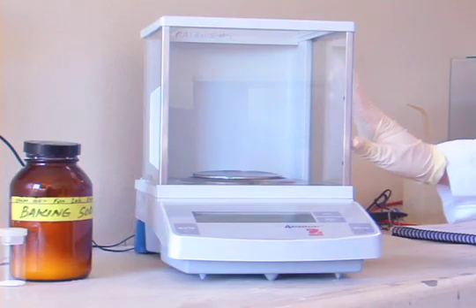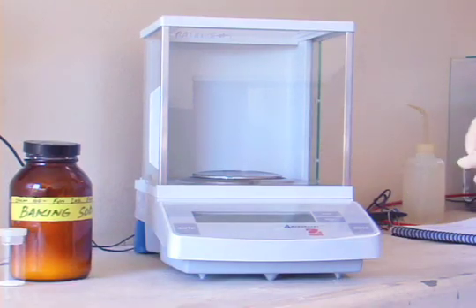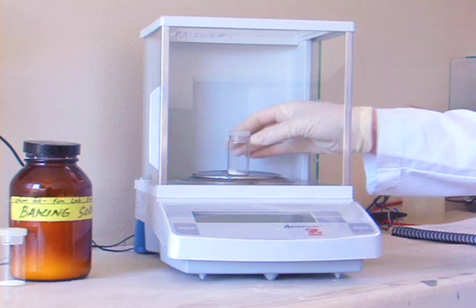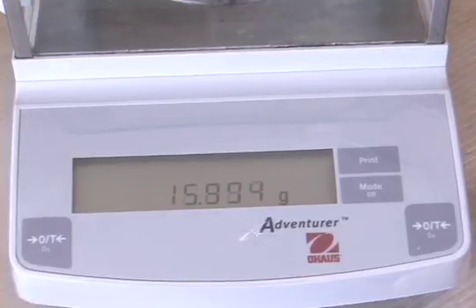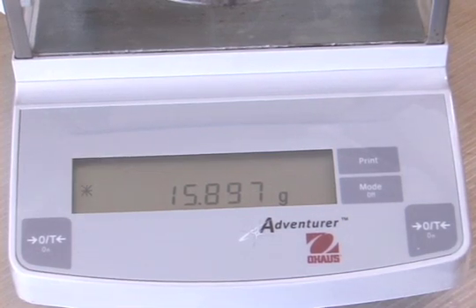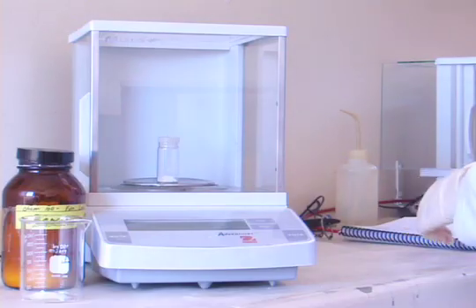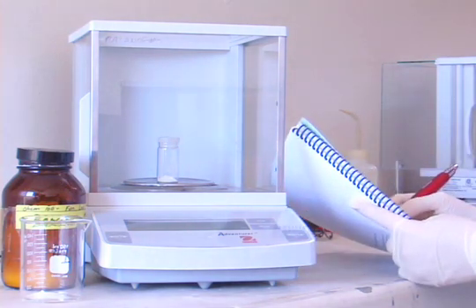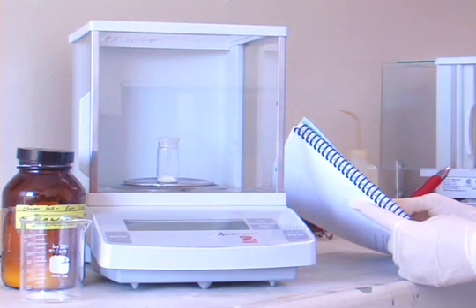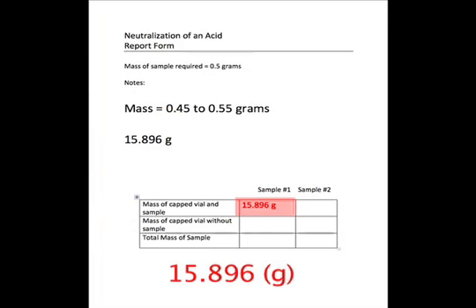Place the capped weighing vial containing the solid on the scale to determine its total mass. Once the star appears in the readout, record the mass of the capped vial and its contents on your report form. The mass of the vial and its contents is 15.896 grams.